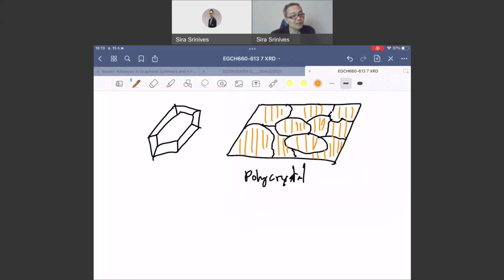Our crystallinity level is pretty high on a polycrystal with bigger grains. That's what we tend to learn from the light diffraction pattern, right? For XRD, we can do one better. The better one is that we can find the size of this grain. We would get the number of this grain, as the material with the bigger grain size would be more crystalline than the other. We can have that kind of idea.